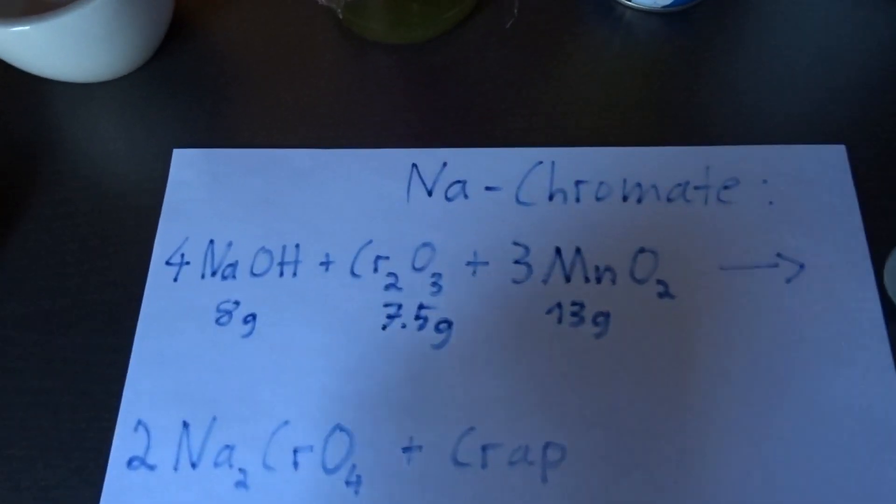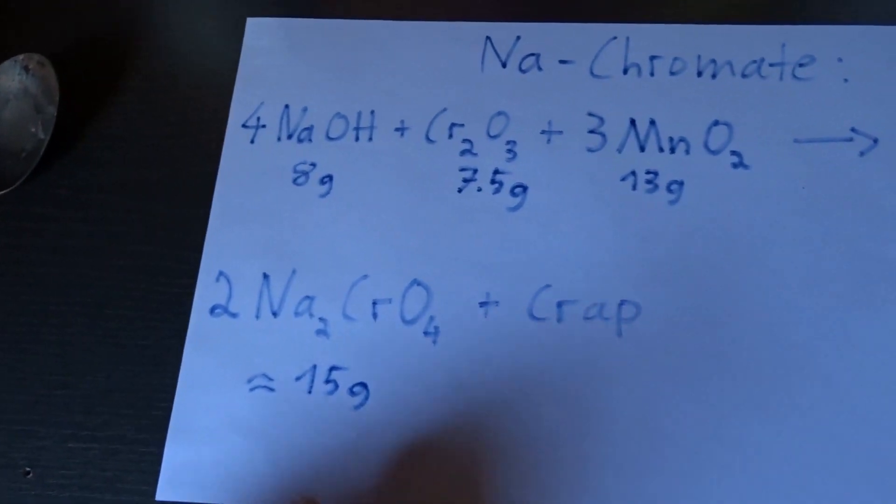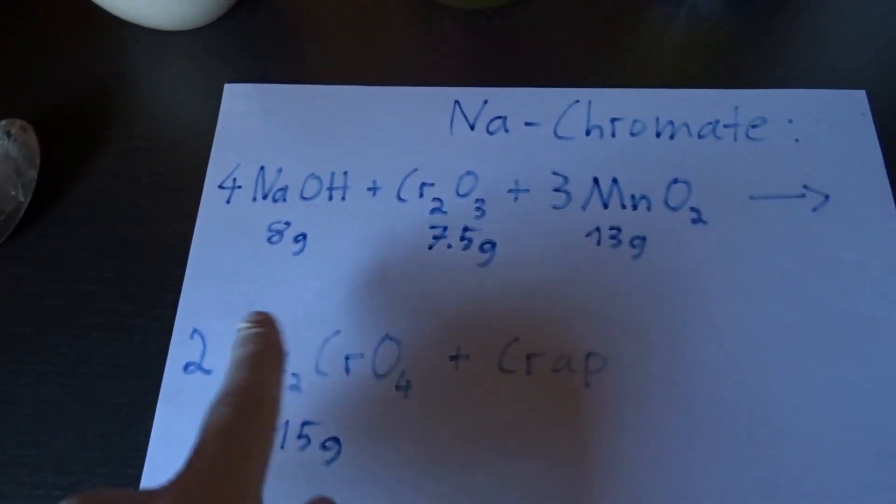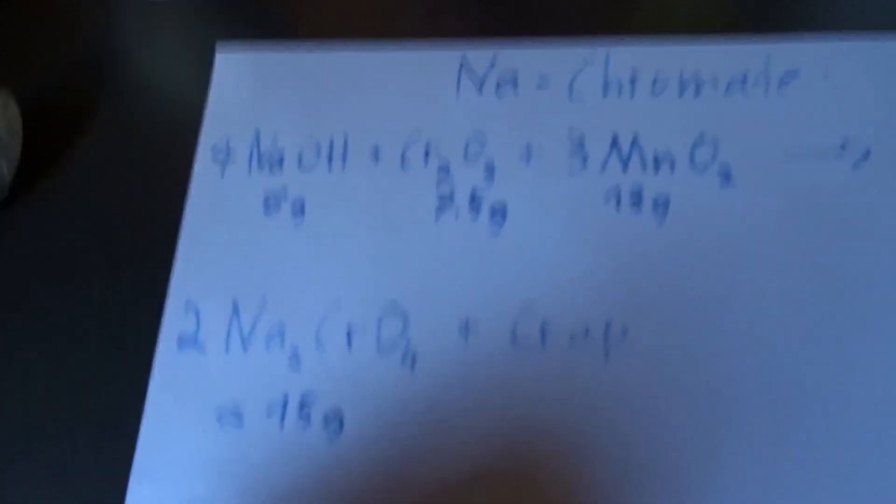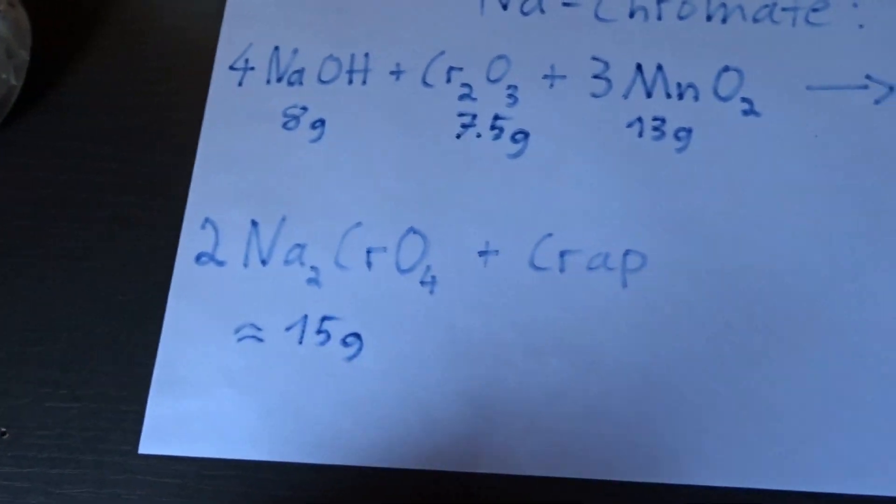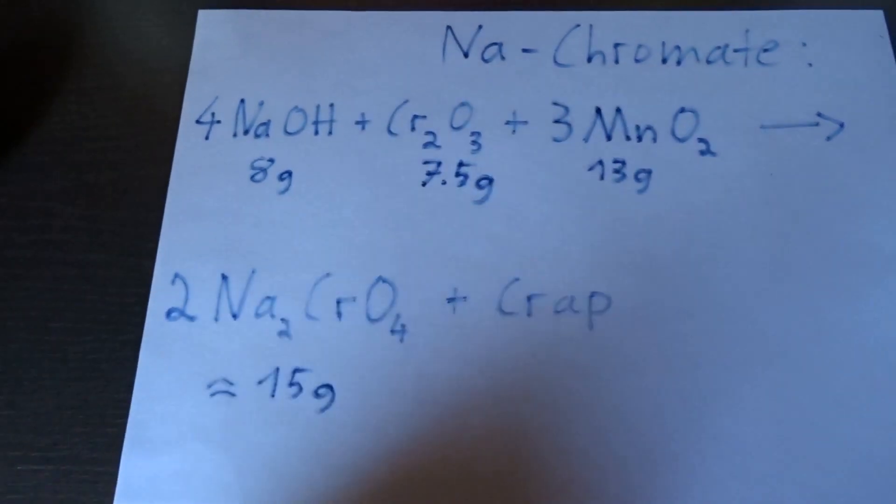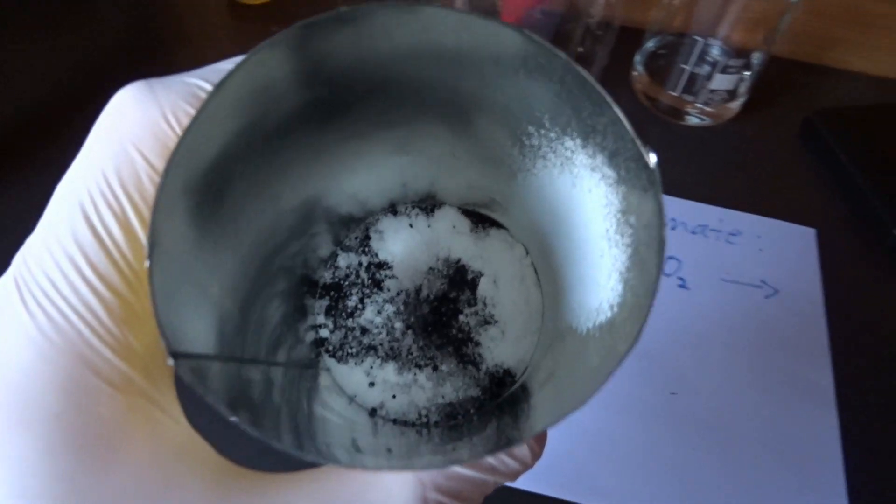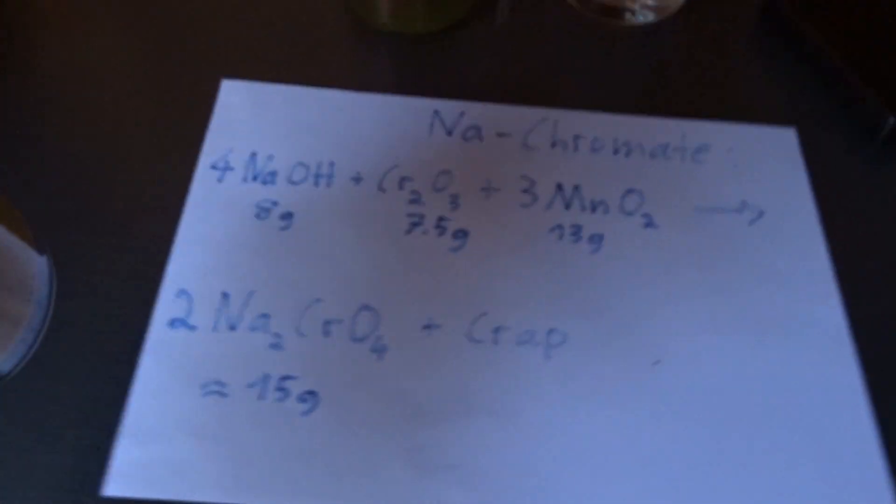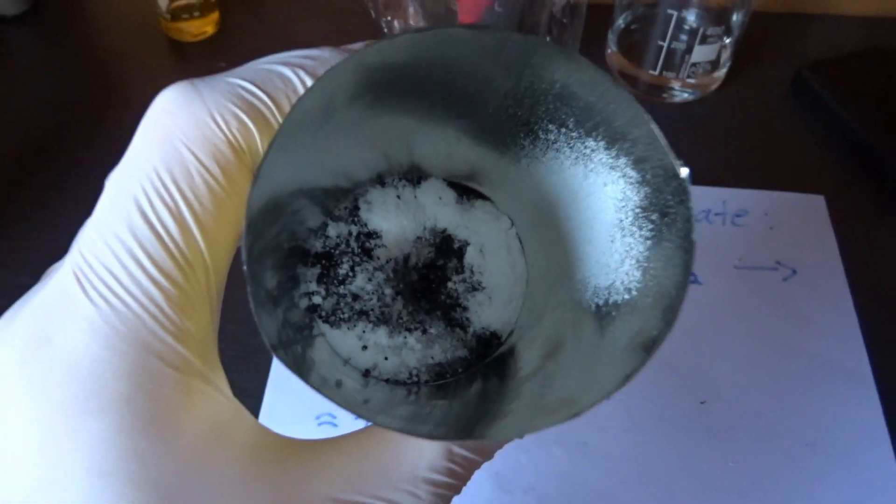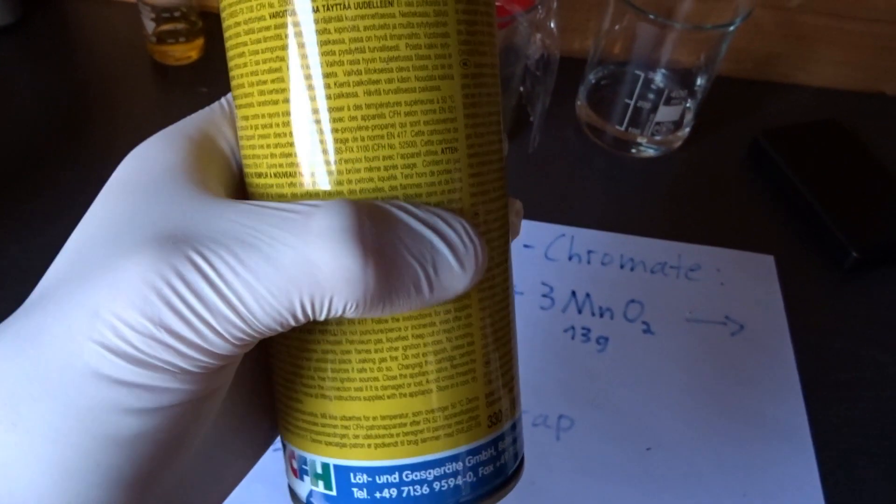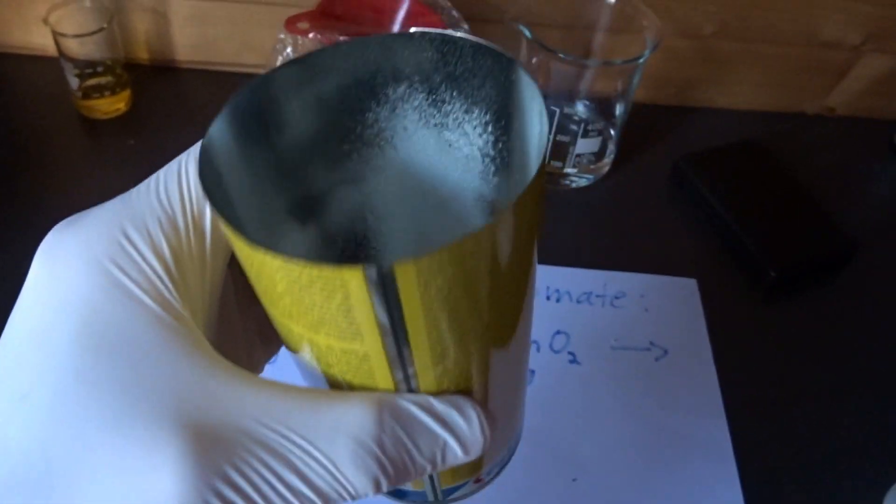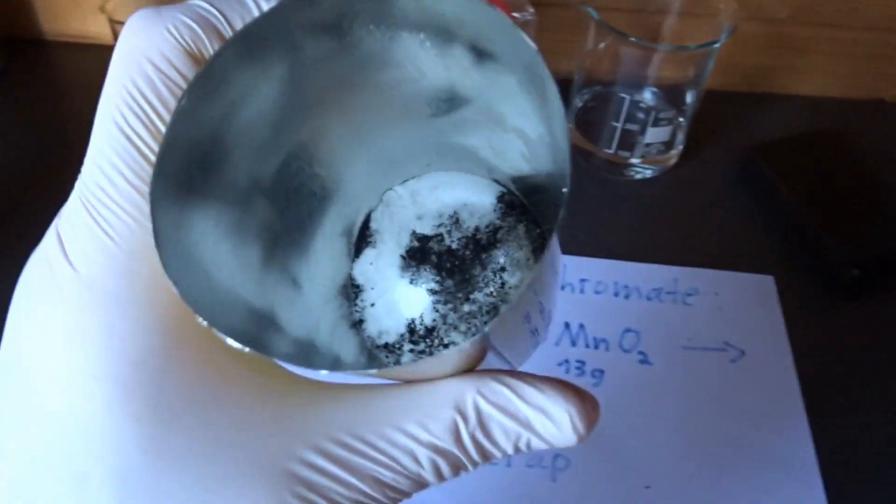This all takes place at around 400°C and my goal is to make 15 grams. And here you see the corresponding educts to make 15 grams of product. I don't expect to recover everything so the yield will probably around 10 grams. I've now added all the reaction educts to a cutoff gas can. And this is the reaction container, so called the crucible.